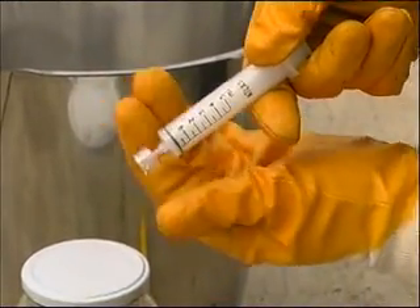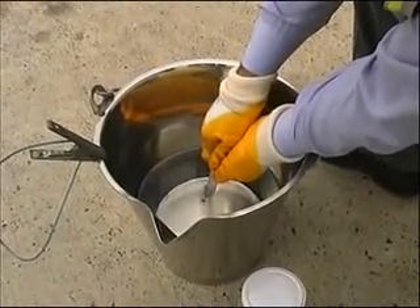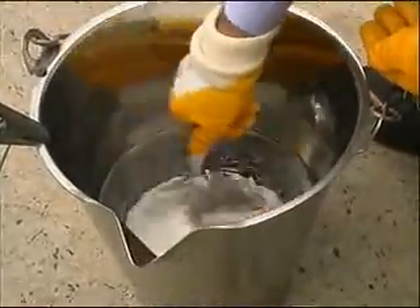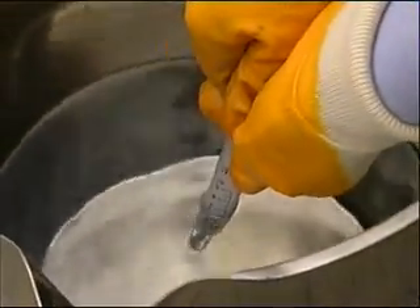Step 3: Draw a sample. Step 4: Immerse the capsule and approximately half the syringe using a circular motion into the sample. Ensure you are wearing gloves that are impervious to fuel.